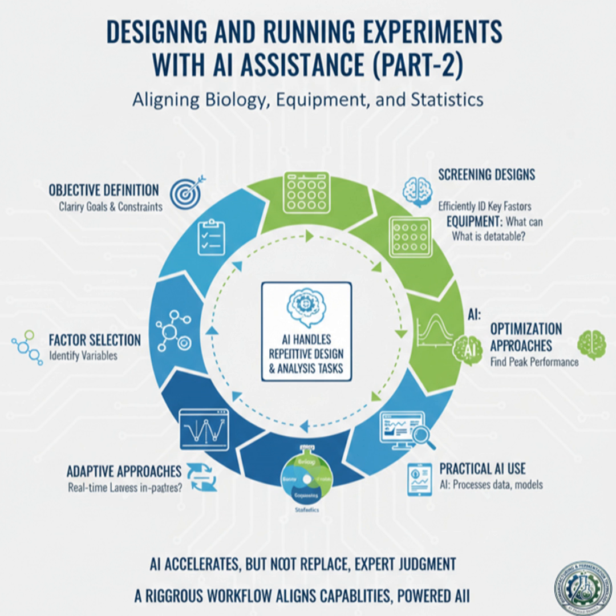We're back to the statistically cute problem again. We are. The AI might suggest adding two ingredients that you know will precipitate when they're mixed, or it might suggest a temperature that yeast can survive, but the equipment can't actually hold consistently. So the AI can generate the math, but it can't see the physical reality of the lab bench? Not at all. The validation step is critical. You have to sanity check the machine.